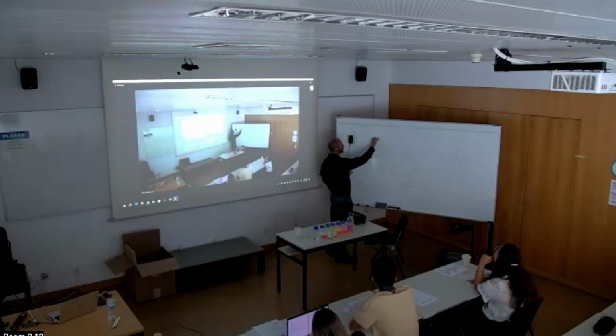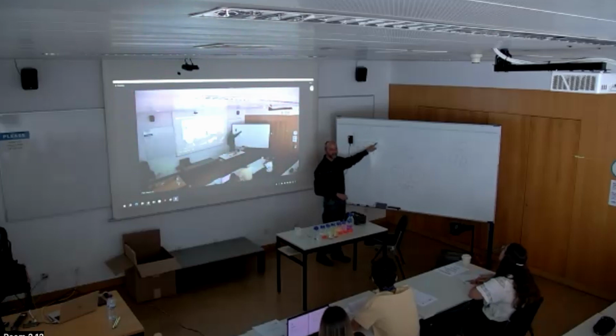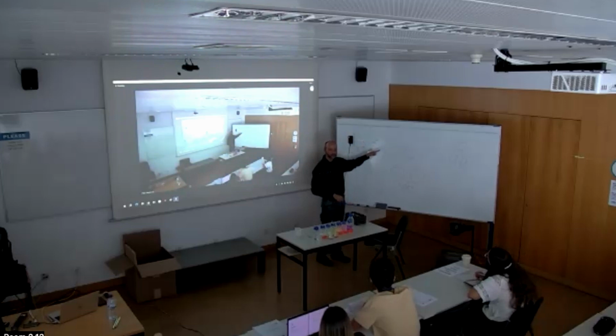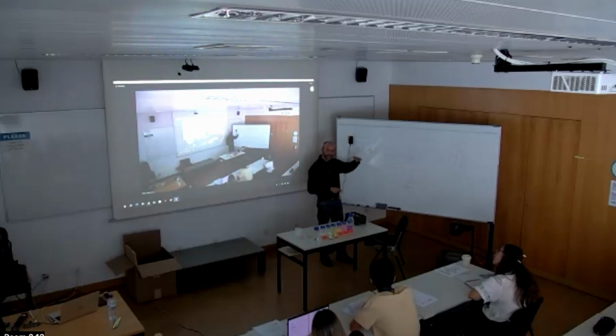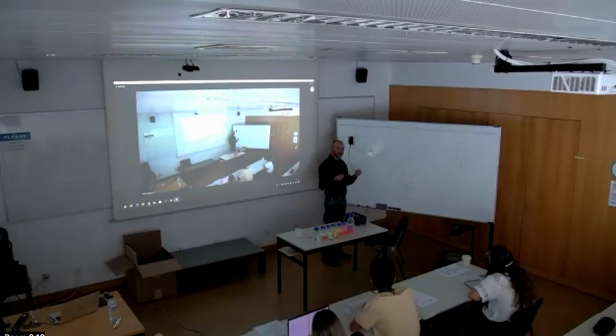In fact, if I turn this like this, you will see that there is a certain bending of light, and light doesn't propagate straight, it bends. And then what happens here? So it enters, bends, and then it exits. And what does it do? Return to the initial direction. Exactly. So then it bends again, so it comes back to the initial direction of propagation. So it means that there is a proportionality that is preserved when entering from one medium to the other, or exiting, according to the angle of entrance. That's really good.